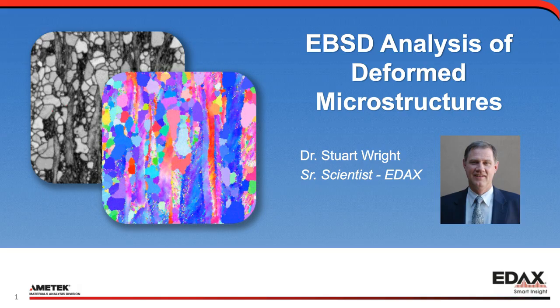Stuart was first introduced to EBSD as an undergraduate student at Brigham Young University, working with the first system in North America. He then moved to Yale University to pursue a PhD under Professor Brent Adams. His thesis research focused on automating the EBSD technique. This effort led to the first fully automated EBSD scans in the fall of 1991. After graduating, Stuart joined Los Alamos National Lab and continued work in microtexture and texture analysis using both the OIM technique and conventional X-ray diffraction.